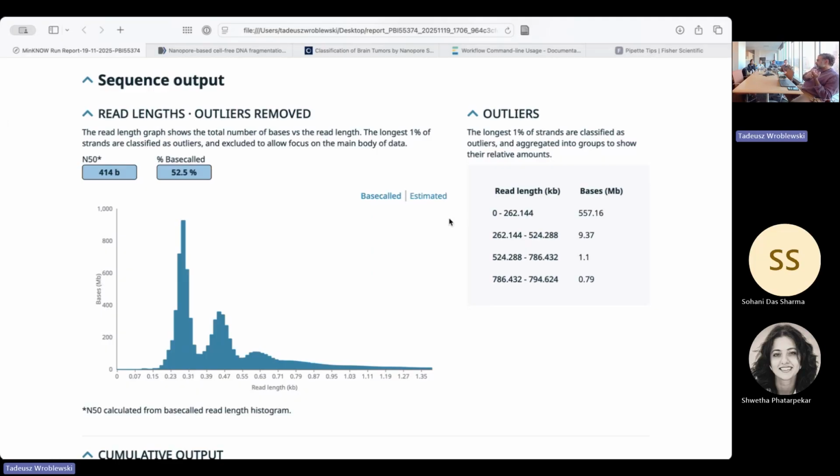If we use the P2 Solo, it's fine. You are getting real-time data, including the methylation. If you use the smaller platform, I think it would also be hard because those are not that computationally capable. This is a computationally very expensive process, right? So that is maybe not possible, not in all contexts.